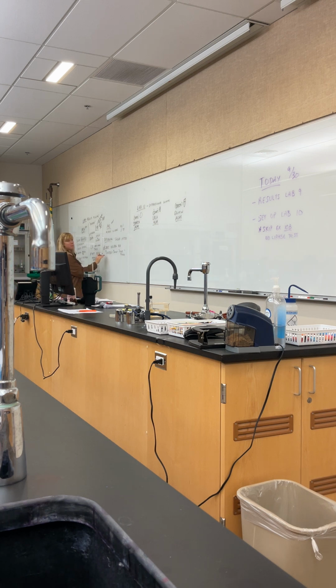So what that means is that my Proteus cannot eat a lot of lactose. So if I see it there, it's not causing a pH shift, because it's not eating a lot of lactose. It can grow, but I don't see a color shift. E. coli can grow, and it is going to have that pink color shift.